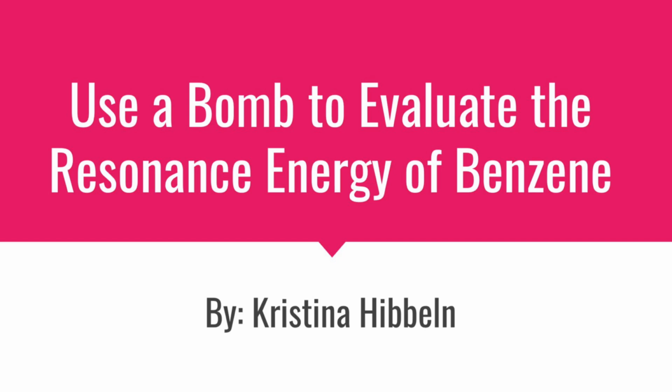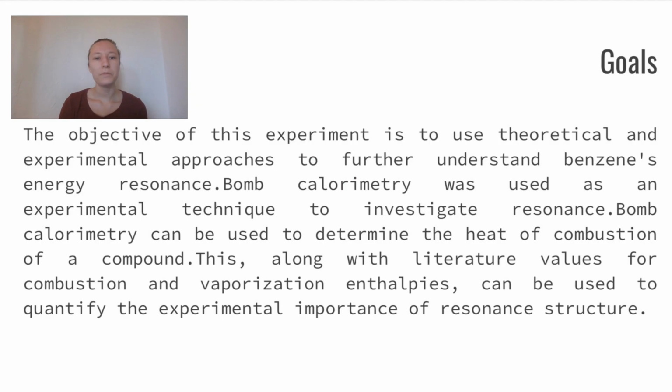Use a bomb calorimeter to evaluate the resonance energy of benzene, by Kristina Hibbeln. The objective of this experiment is to use theoretical and experimental approaches to further understand benzene's resonance energy. Bomb calorimetry was used as an experimental technique to investigate resonance.